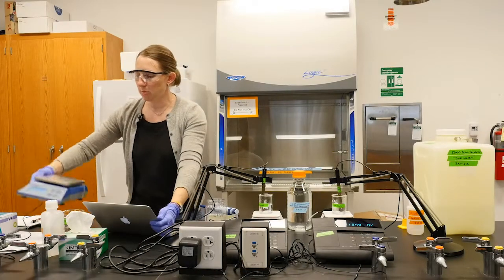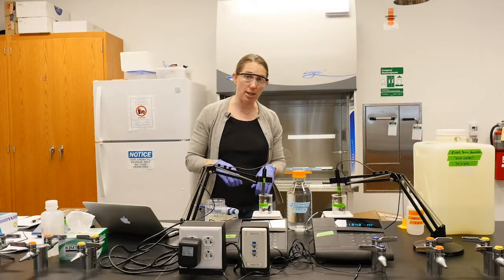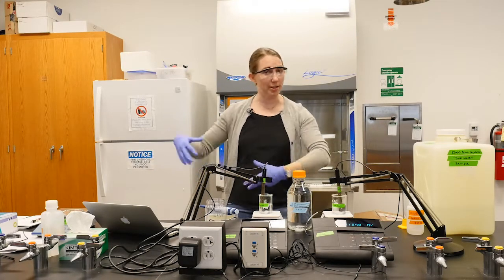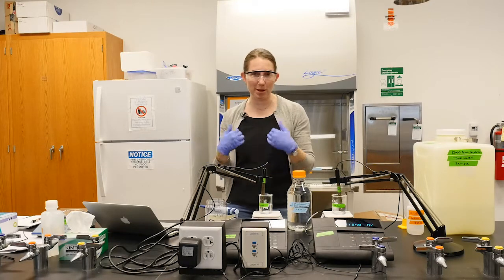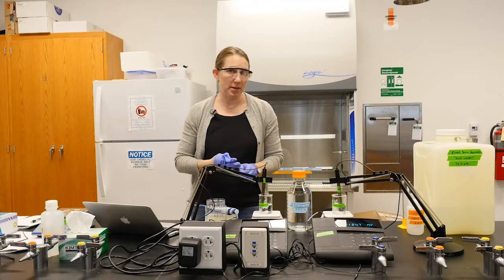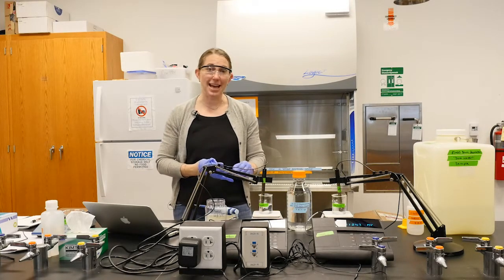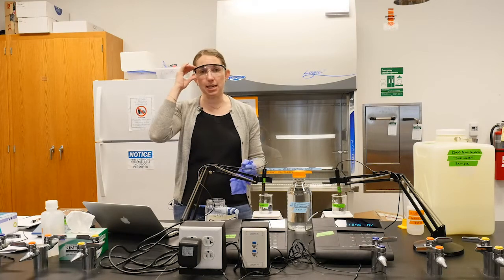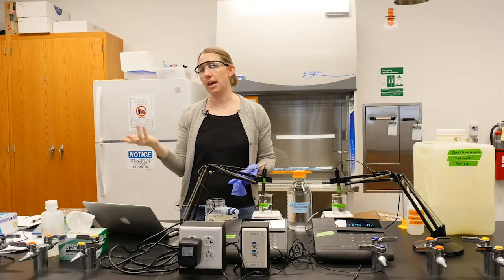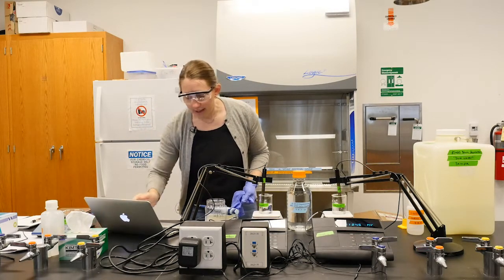And this is one lab where, rather than recording in your lab notebook, we do recommend that you record directly onto an Excel file. So ideally, I would have a scribe here with me who would type as we go, so I'm not typing in gloves. So we're going to record the values as we go because your Excel template is set up with a graph that's going to plot these values as you go, and you're going to be able to see the titration points as you go here. You kind of need that visual indicator for knowing when you're done. So we're going to plot these as we go.